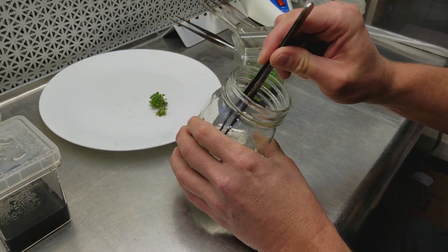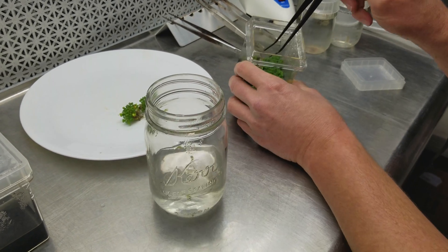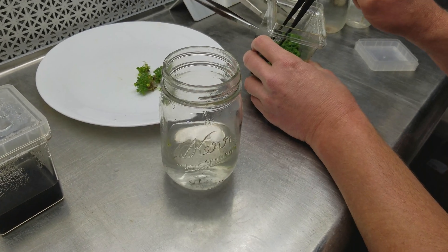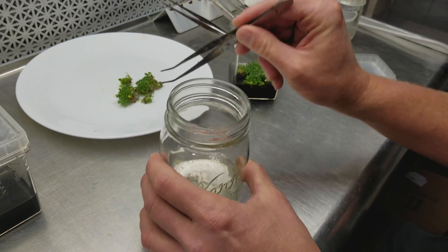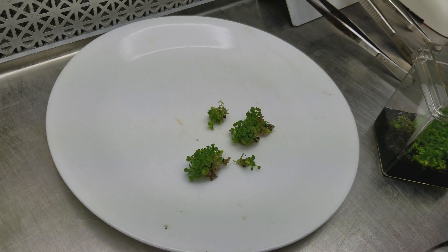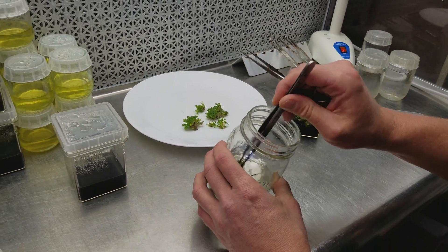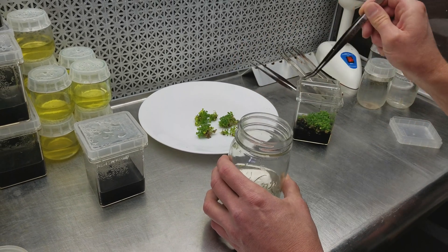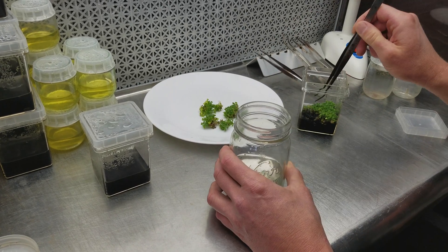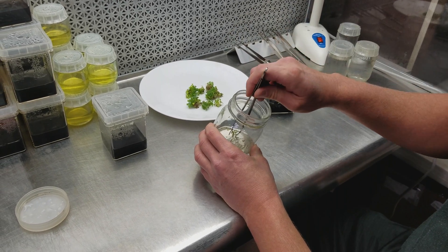This culture grew fairly well — as you can see there are lots of little clumps of Cephalotus in here. I'm going to try to get them all out onto the plate, clean them up a little bit, and start putting them in the fresh media. The bottoms of some plants have a little dead material on them, which isn't a big deal. If I keep up with the replating they typically don't get much dead stuff on them.